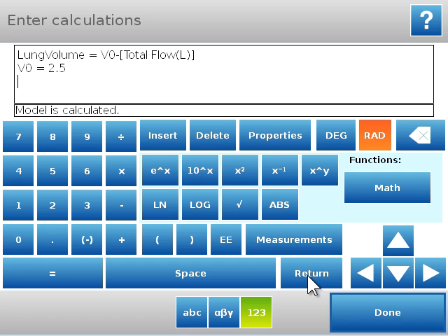So, as a person breathes normally, just inhaling and exhaling at a normal rate, there's a large amount of air that their lung has the capacity for, but is not actually being moved during that inhalation and exhalation. So that's the functional residual capacity, the volume of air that remains in the lungs during normal breathing. So I've defined what V0 is, 2.5 liters, and that's just a general guideline for most individuals and should work for your labs. Notice I did not put a space between lung and volume. The name that you give your calculation needs to be all one word.